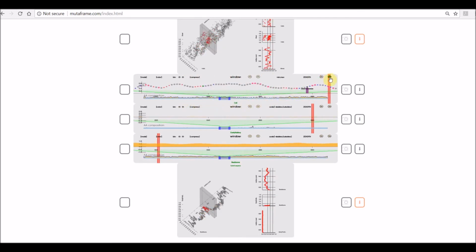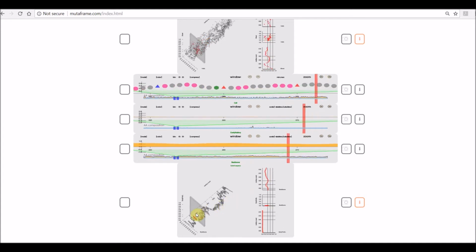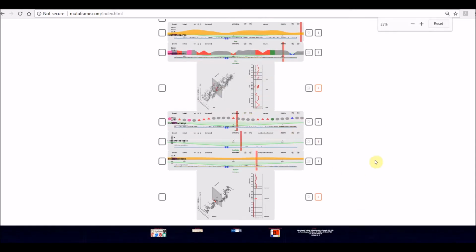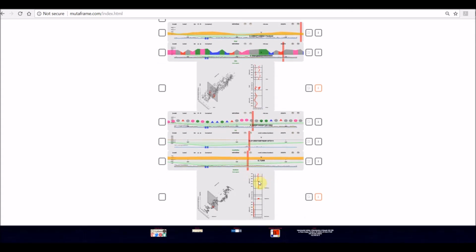Now, if I zoom out in this one, the lower box and the rest of these plots will expand, will respond. If I zoom in, they will also zoom in. If I mouse over one of these points, you will also see it in the rest of the plots, not only these four in the bottom, but everything. So they will all move together. This is just to illustrate how lengthy and how creative you can get with it.